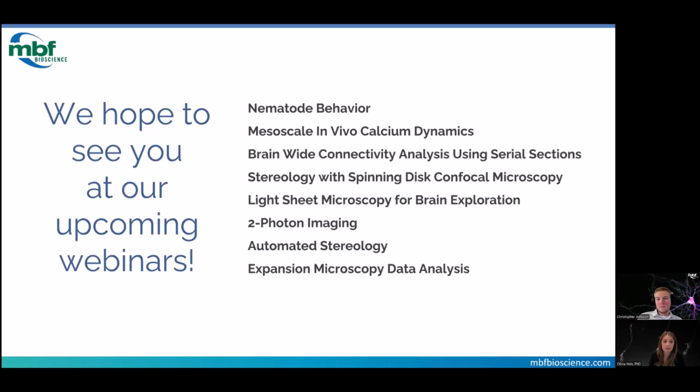Cool. So the peak detection is kind of digitizing the signal because it's all or none. Have you guys had experience working on things that are more scalar? Like if you are looking at the baseline, can you have that affect some sort of actuator or output that is not binary? Yeah, we've done this for labs before. It depends on the hardware that you're using, and if you have some kind of hardware that can accept a continuous value, then you can feed it that value. And you actually can do this with the peak finding workflow as well. You don't have to just do all or nothing for peaks, but you can take an average over the moving window. But yeah, you can essentially control the pitch on a tone generator and have it go up and down with brain activity or something like that.